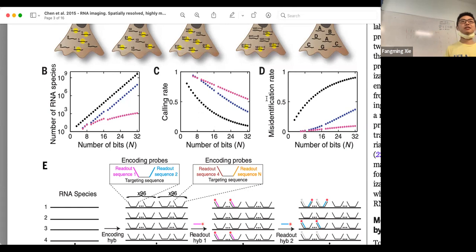So their idea is quite simple. Because you have a certain error rate, what if we design the barcodes such that the barcodes assigned to different genes all have Hamming distance 4, meaning they all differ by 4 bits. So if you mess up 1 bit, it won't be the end of the world, because it allows you to correct it. Only if you mess up 4 bits, or actually fewer than four, two bits either way, can you misclassify one kind of gene into another. So that's the idea. Modified Hamming distance 4 requires all genes to be assigned a barcode that is sufficiently different by 4.